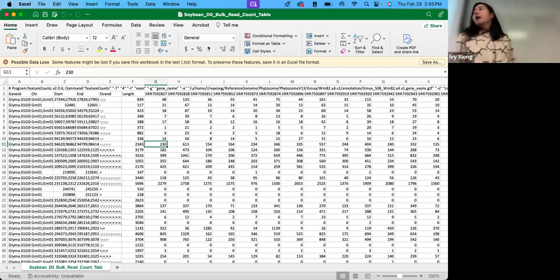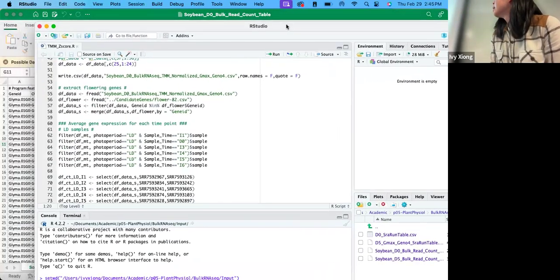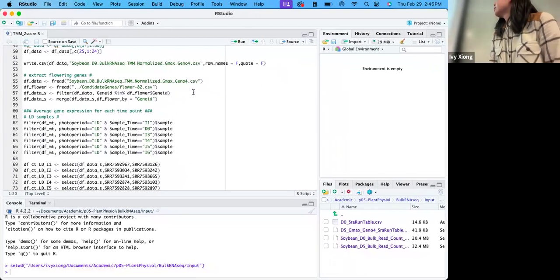We can get the paste function. Detail this function, right? Because it couldn't find it. Did you create it? You have to create it first.